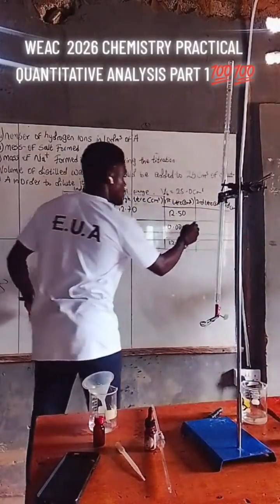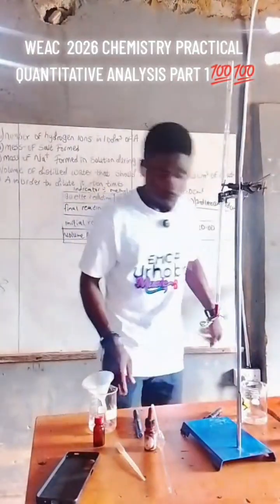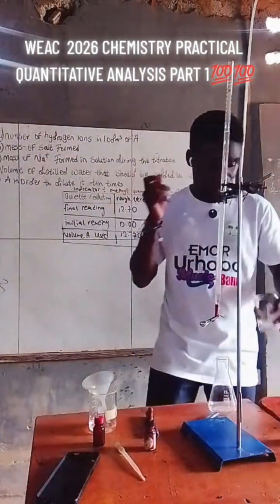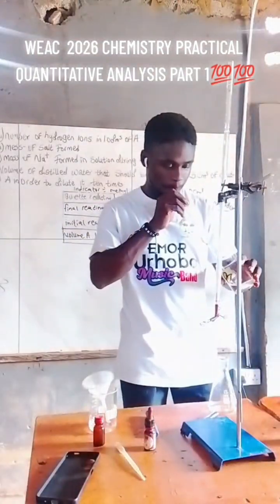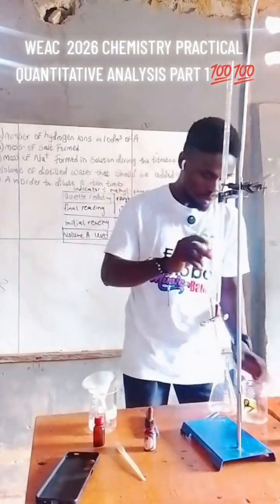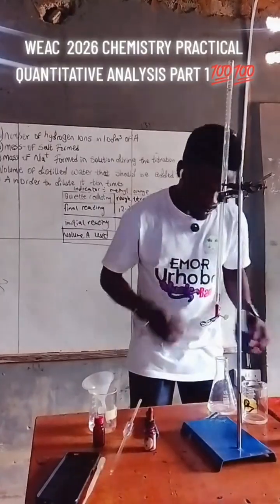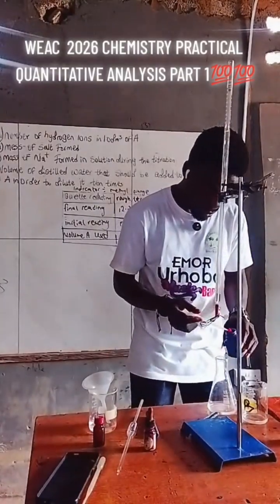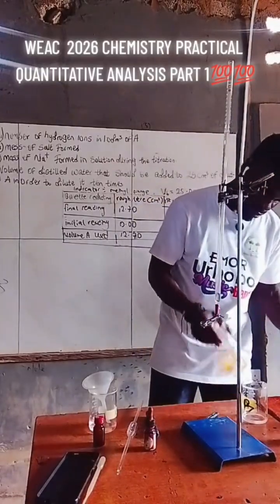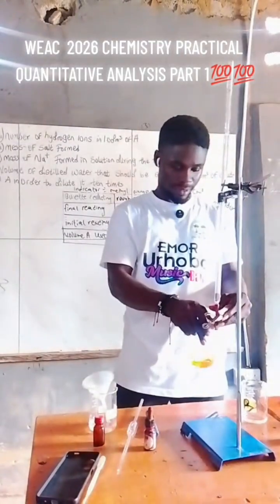So, initial here what? 10.00, right? So yes, you can start from where you stopped. Okay? You can start for the burette. Be careful when you are reading. Good. So, from 10, let's say we arrive at.